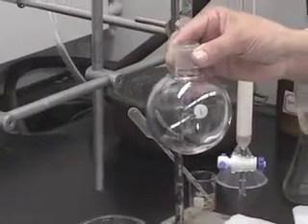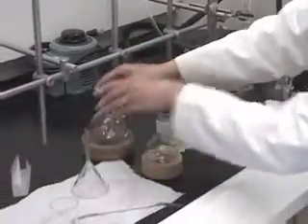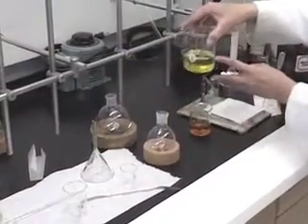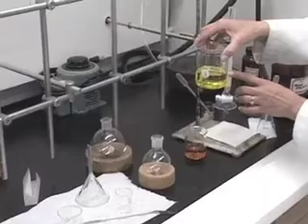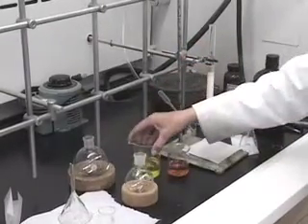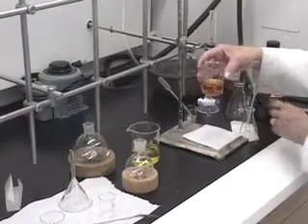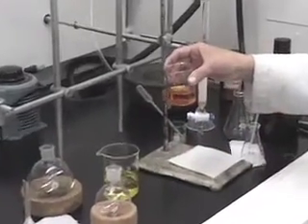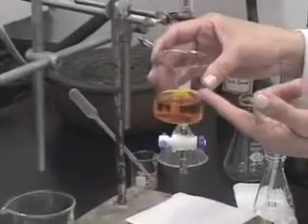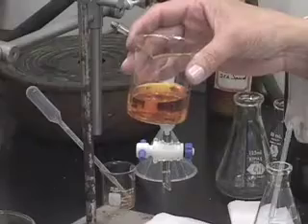Why do I have two different size flasks? The yellow fraction has about 100 ml of solution. The orange one, on the other hand — this beaker doesn't have any markings, but this is a 100 ml beaker — so it is less than half full. I would say it is about 40 ml.